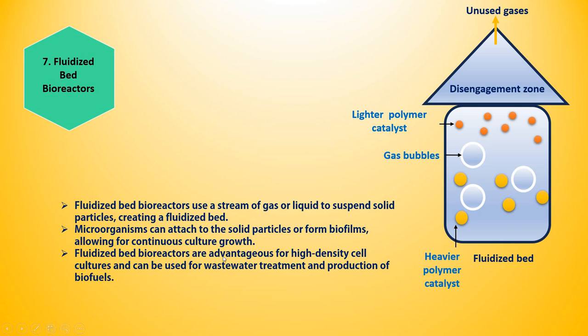And fluidized bed bioreactors are advantageous for high density cell cultures where the cell density is very high within the bioreactor, and it is specifically used in wastewater treatment and production of biofuels. And another case is where the target products consist of different masses.